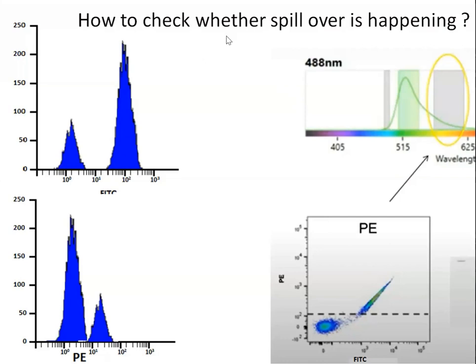Any random guesses? How do you want to check whether the channel designated for a particular fluorochrome only collects its light, and the other channels are not getting light from the emitted fluorescence of that one fluorochrome, say for example FITC? Okay, so how do we do this, I'll tell you.